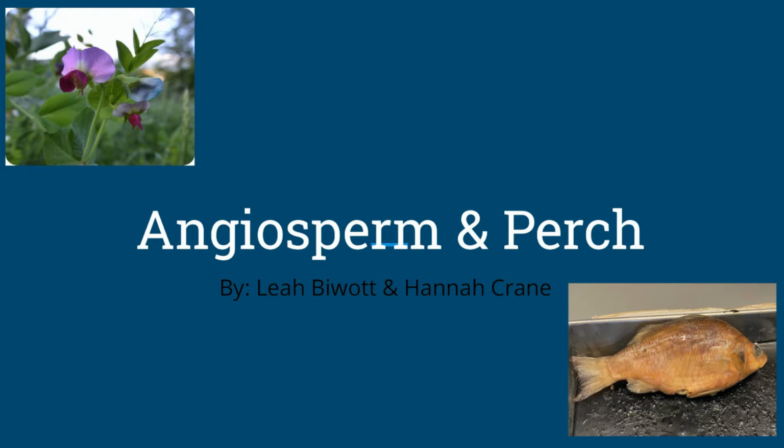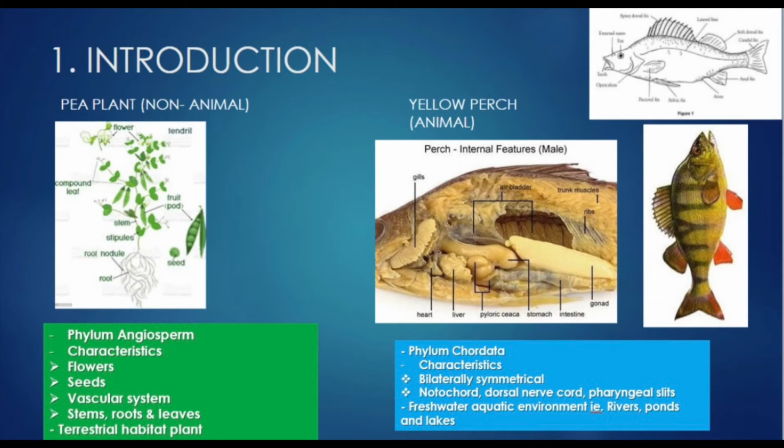Hi, this is Leah and Hannah, and we dissected a perch and looked up information on pea plants. Some general information about these two species: for our non-animal species, the common name is pea plant.